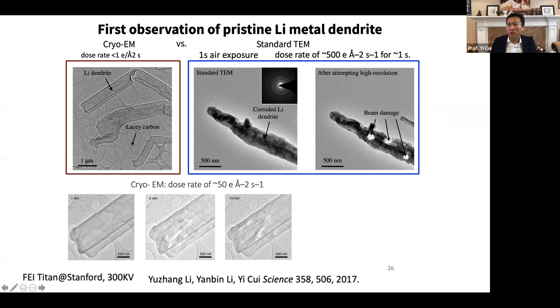What's really telling you metallic lithium, element number 3, reacted with air is that it became dark in color. Lithium metal should be light in contrast, like what we see at the top left. Then you only see the edge that's darker, because air generates a solid electrolyte interface, which has higher mass compared to the middle lithium metal. That's normal.